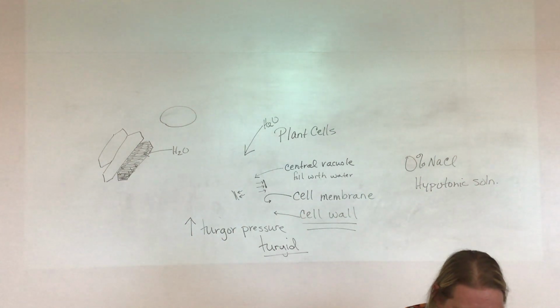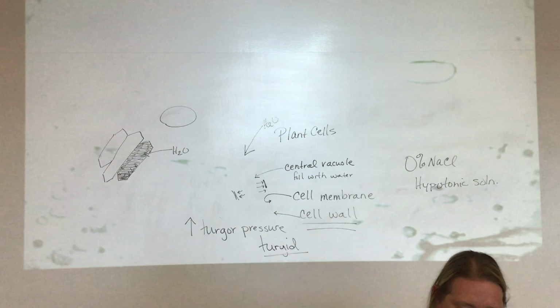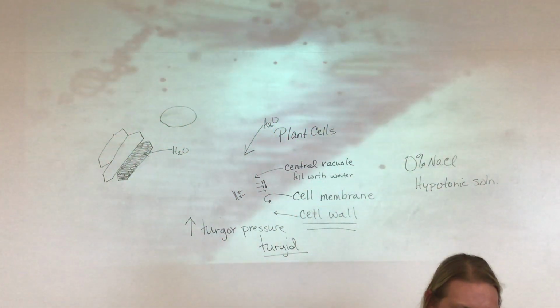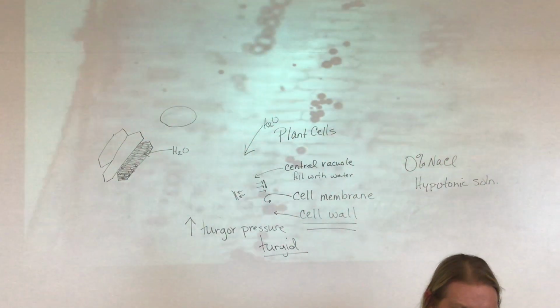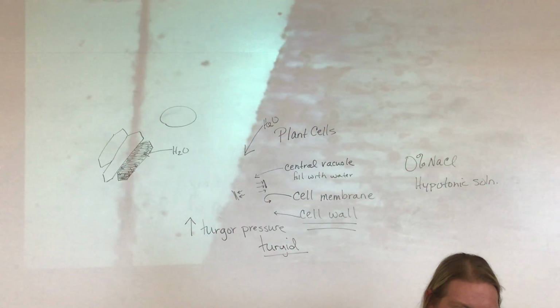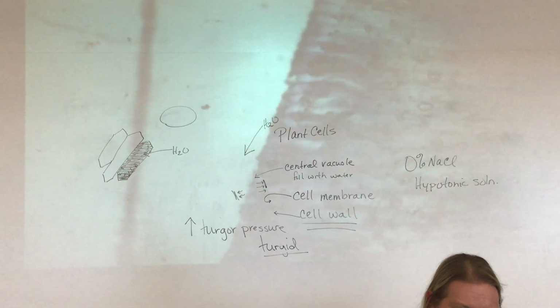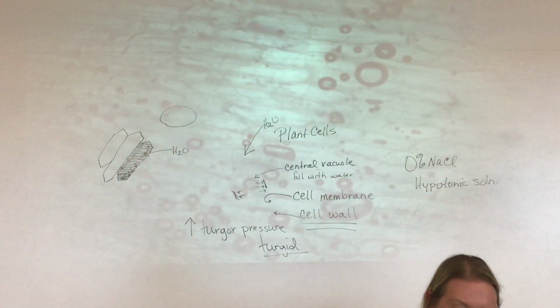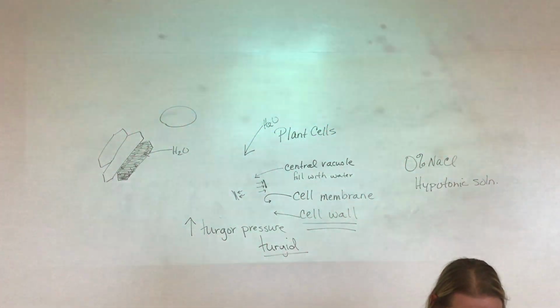All right, let's see if I can find some. Let's find some that are filled in. I have two samples in here. Let's try this one. They've been sitting a while, so they kind of faded.